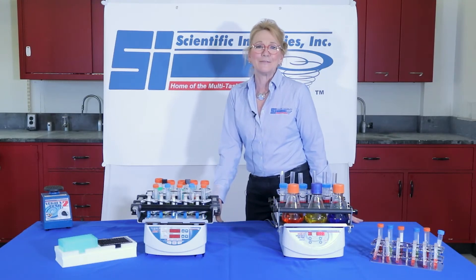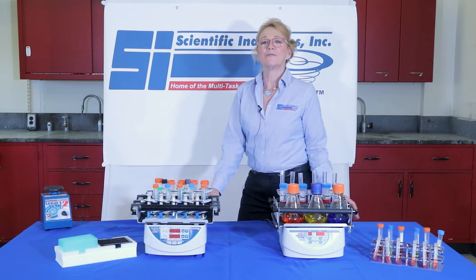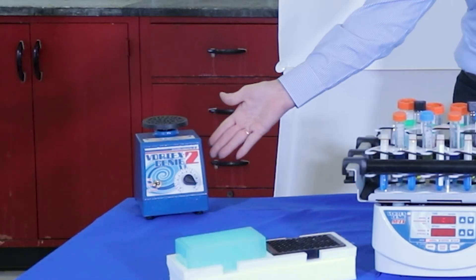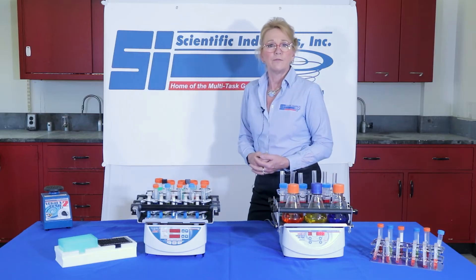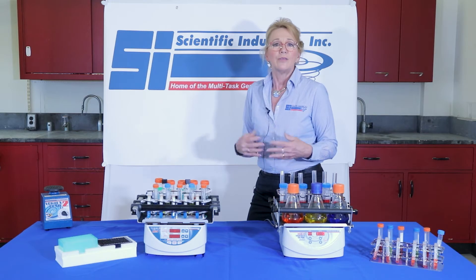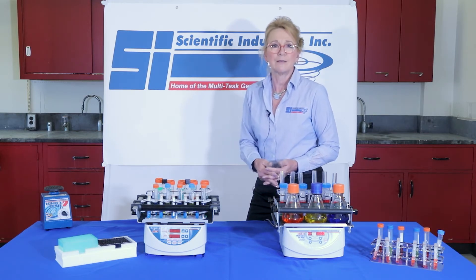Hi, I'm Debbie with Scientific Industries and I'm here today to introduce you to some of our additional Vortex Genie equipment. Many of you already know the infamous Vortex Genie II, but for those of you who need to do larger capacity and larger volume as well, you can do that with our other Vortex mixing products.